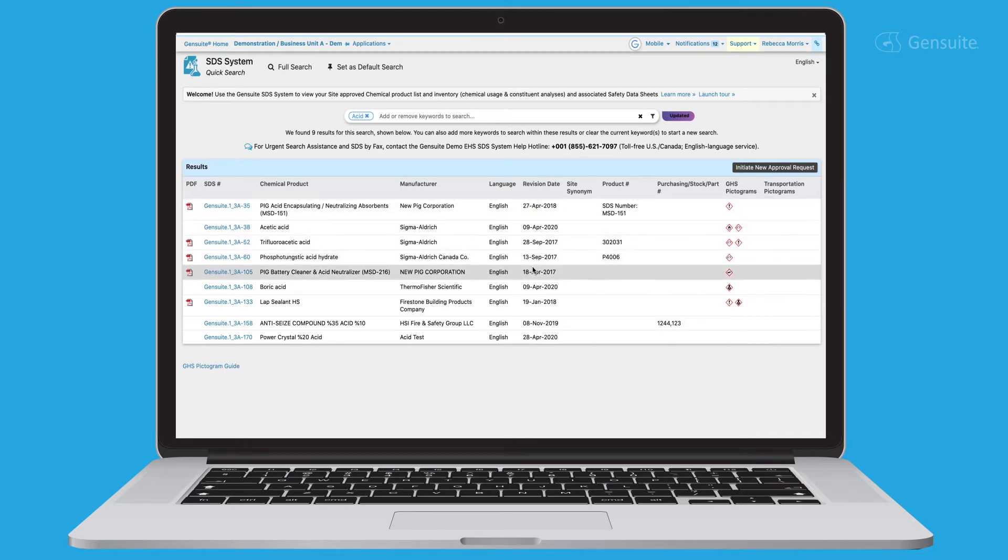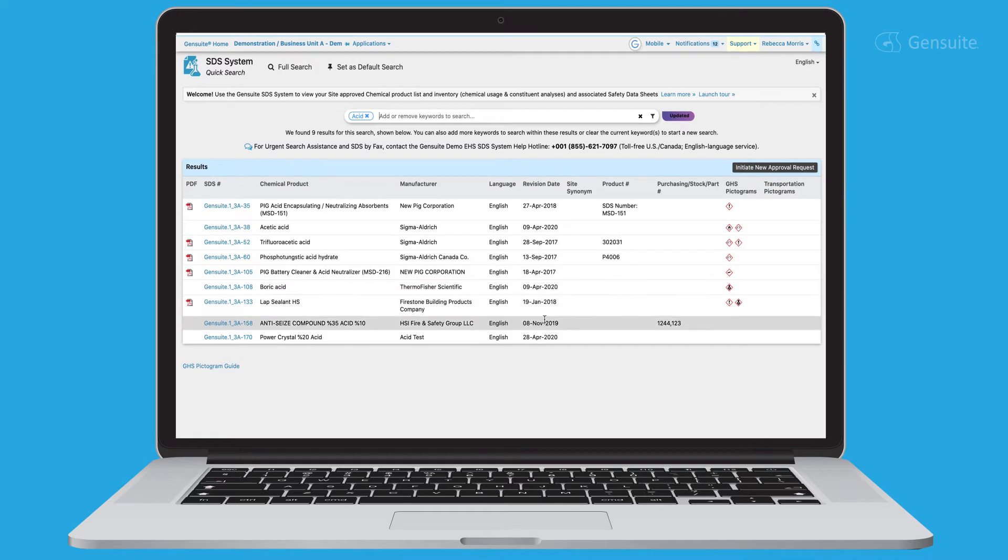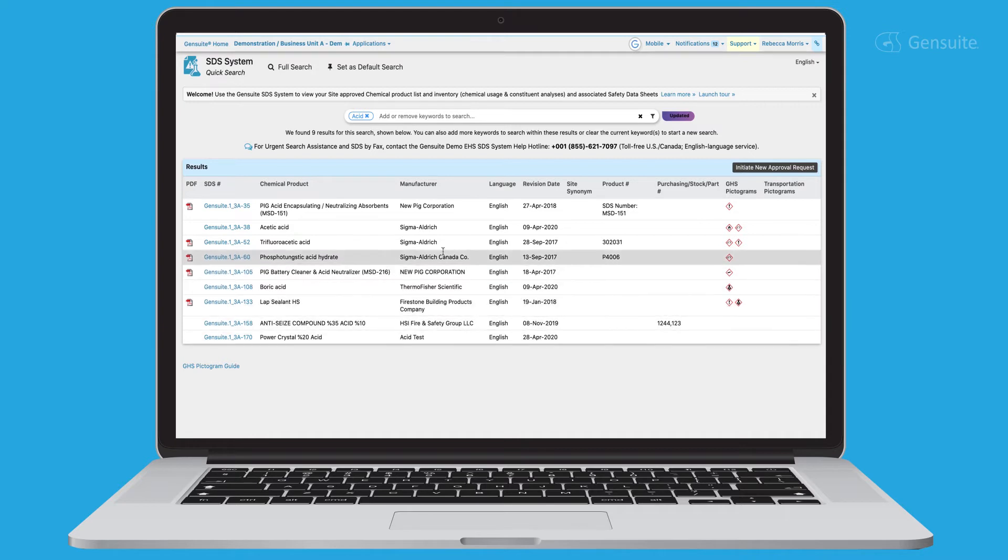Easily search from a vast repository of SDSs. Simply type in the chemical you're searching for, for a list of relevant SDSs available.